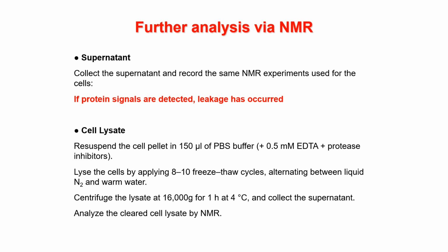And then you can perform a cell lysate and analyze the cell lysate by NMR. To do the lysate, you resuspend the pellet in 150 microliters of PBS, for example.